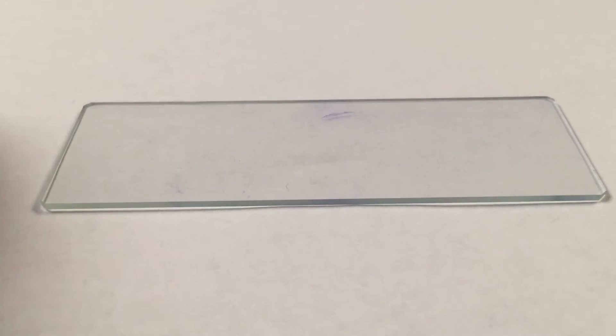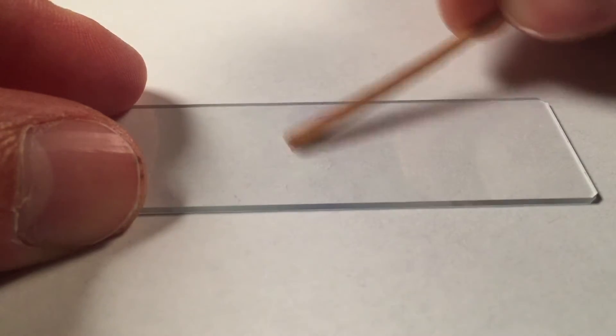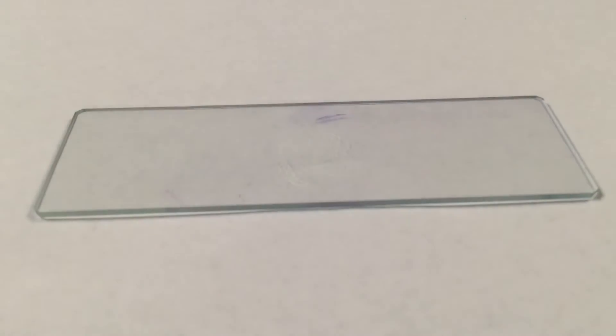The other side too. And that is it — it doesn't even look like there is anything on there, but I will smear that on my slide and it should look like there is just slime on there.